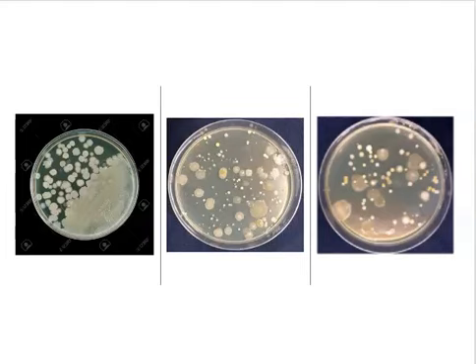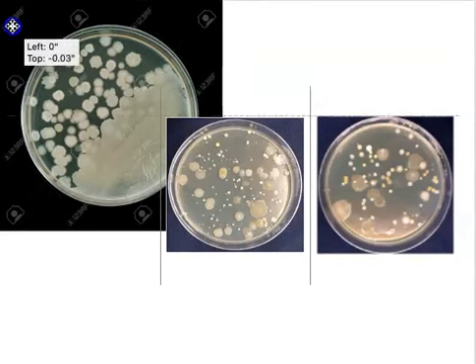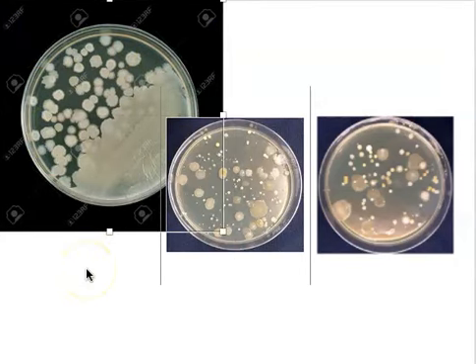The samples that we gather from the environment often have multiple types of bacteria growing on them. And sometimes we have multiple types of organisms. Both bacteria and fungi can grow on our agar plates in the microbiology lab, and fungi also have colony morphology.